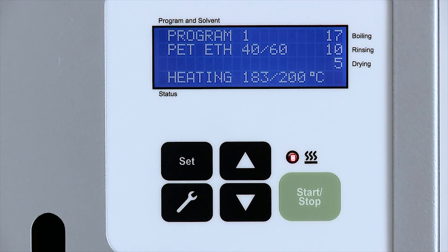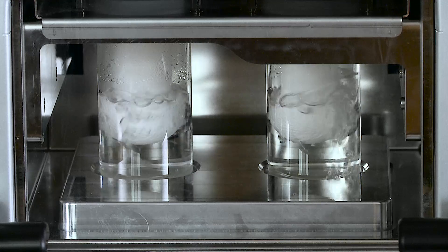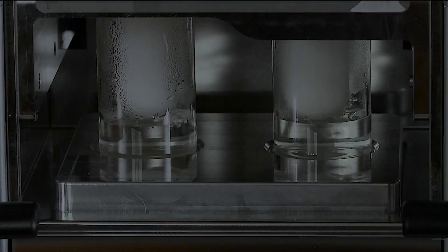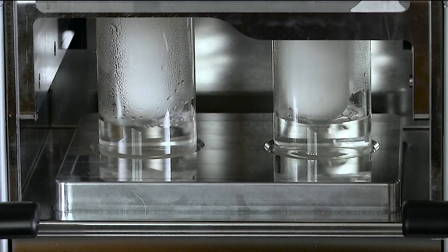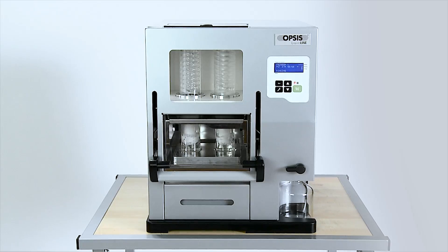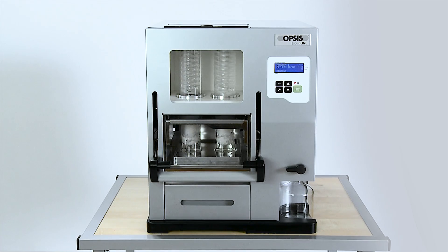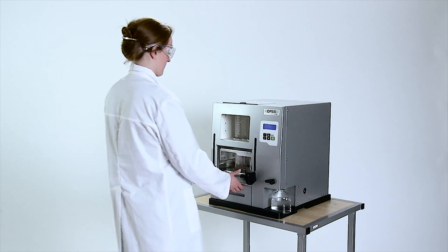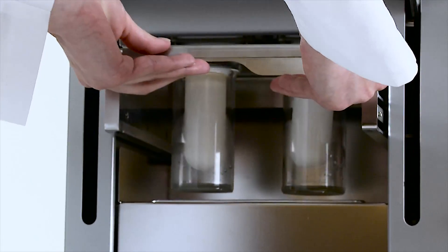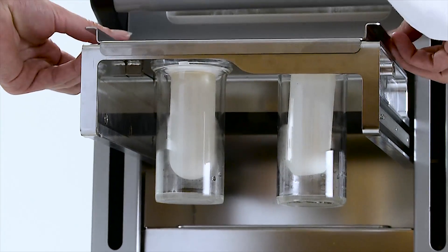Soxrock handles all steps automatically: boiling, rinsing and drying. The solvent can be added in a closed environment and during operation via the condensers. The cellulose thimbles and cups are always removed simultaneously, which reduces dripping of solvents on the hot plate.